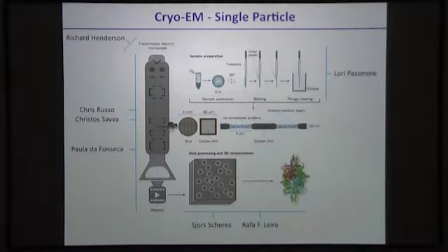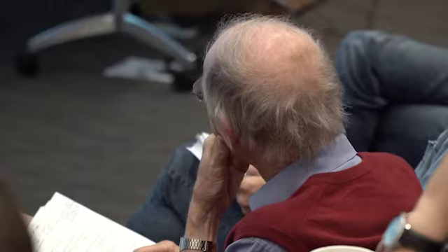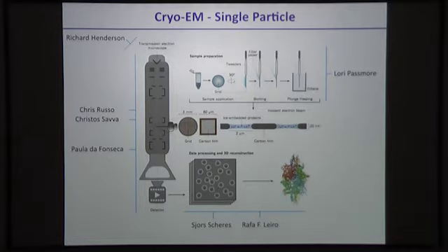Good morning, everyone. Over the last week and yesterday, we've been talking about the whole process of cryo-EM. By now you should be able to get your well-behaved sample onto a grid, make a very nice grid, optimize it and get a very nice distribution of your particles on the ice. Then put it into a microscope, align it, and put it in conditions where you can obtain high-resolution information in your images. Then you can get those images, put them on a computer and process them in order to make a reconstruction of the object that you imaged in the microscope.